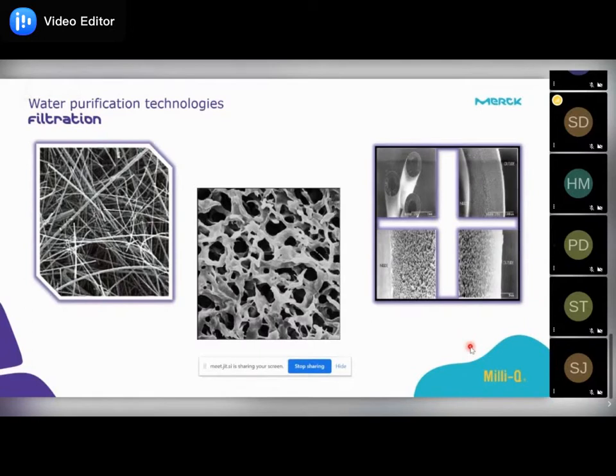If you go to any pharmaceutical organization or any company, whomsoever is working on microbiology, they are all very familiar with this term, 0.22 micron filter. So it's a screen filter basically. And there is another specific filter called ultrafiltration. This ultrafiltration removes various nucleases as well as endotoxin. If your working area is cell culture, or sometimes PCR or RT-PCR, this ultrafiltration is recommended to use. Those filters are very much standardized globally, with various kinds of global validation data, which actually ensures those filters will take care of a very good number of contaminations.